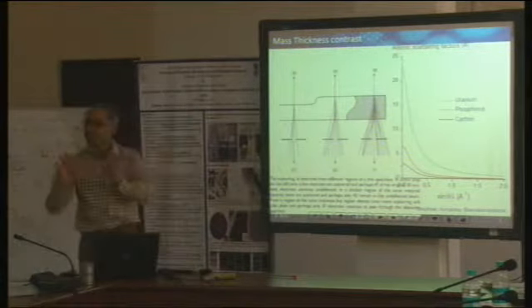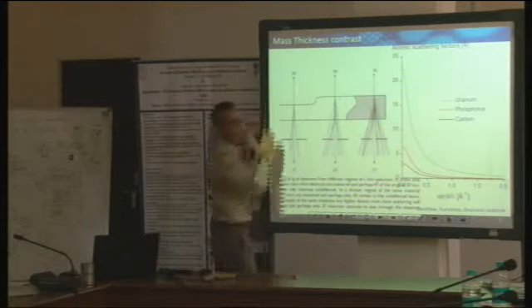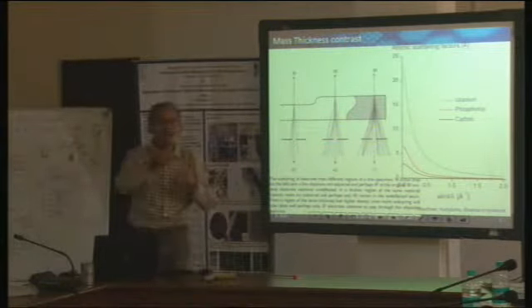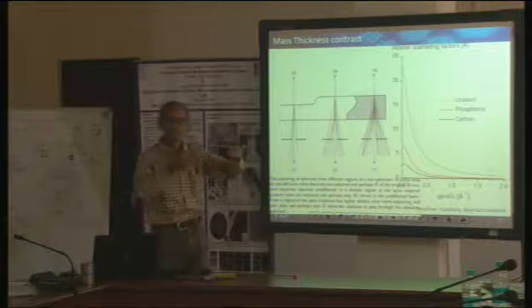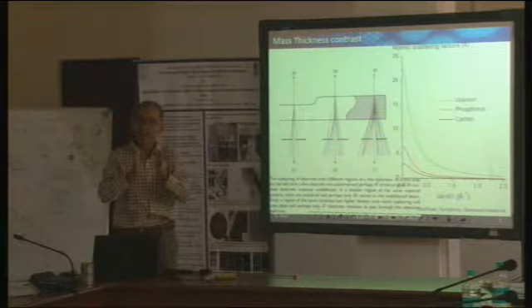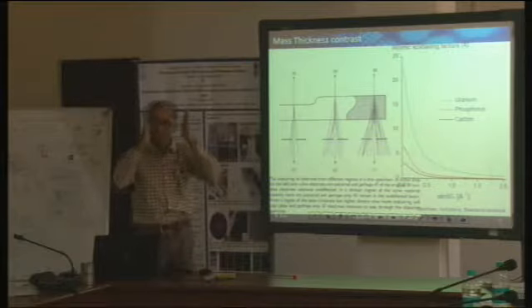Now we imagine that the whole beam is not just light falling at one spot. The light is falling parallelly on the entire area. Let us assume that. And we know how we form an image. Somewhere in this plane there is going to be diffraction. In fact, where we put the objective aperture, there has to be a diffraction plane. In that diffraction plane, we are catching only the zeroth beam, the radiation which was more or less going parallel. We are taking that parallel beam because that's the place where the parallel direction is.